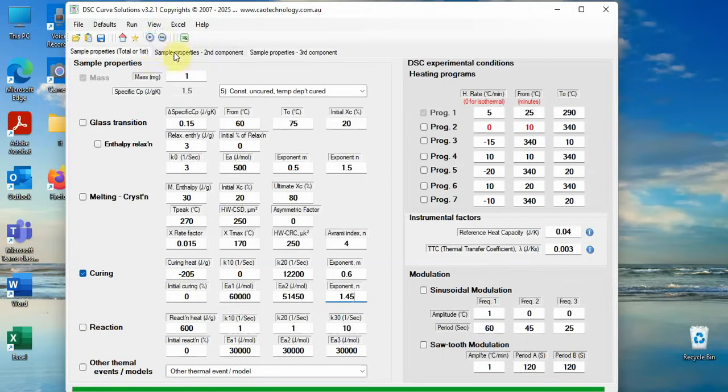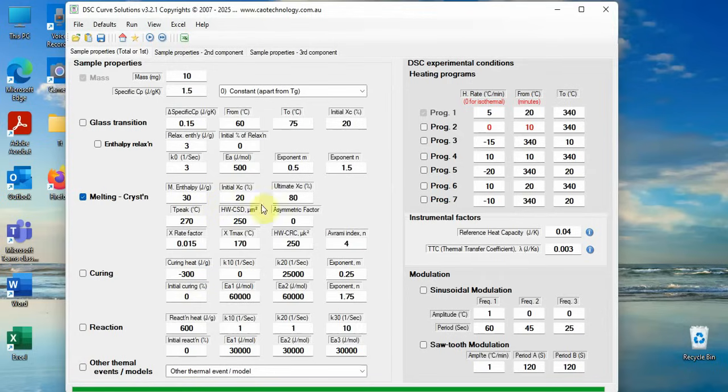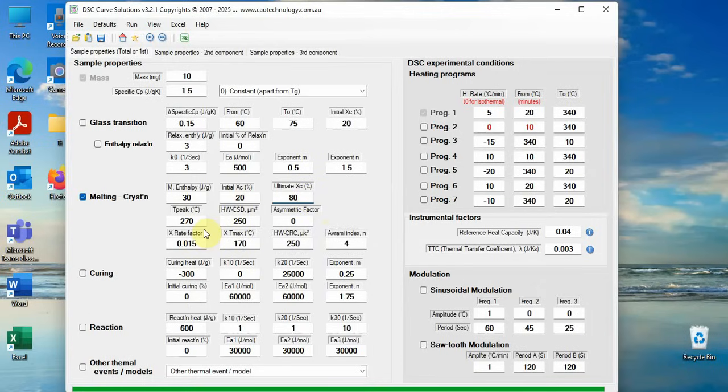Now let's see a sample having melting and crystallization property over the temperature range. Tick the melting crystallization checkbox. Fill in all the relevant boxes with numbers. Here, we assume the sample having initial crystallinity of 20%, maximum crystallinity is 80%.